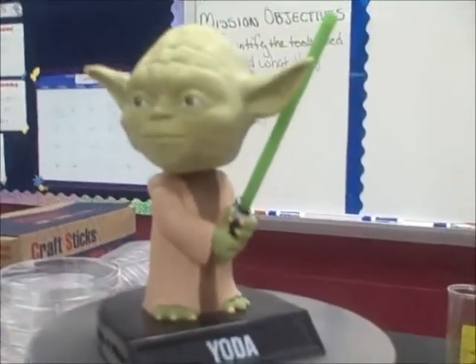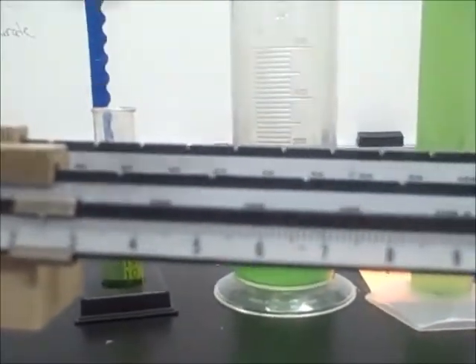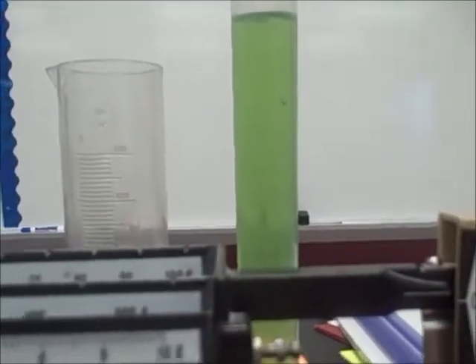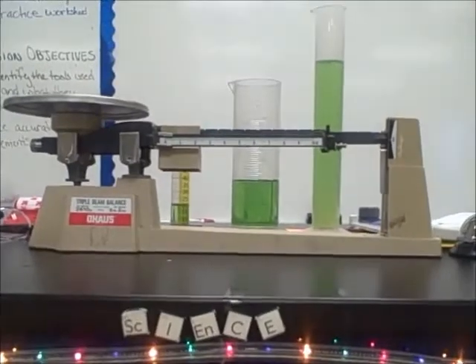To reset it, we'll take Yoda off and bring all our riders back to zero, and the balance is ready to be used again. And that, in a nutshell, is how you would use a triple beam balance.